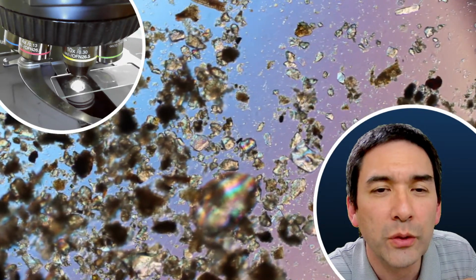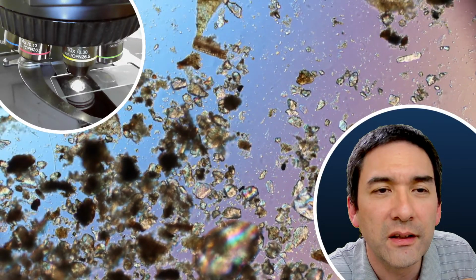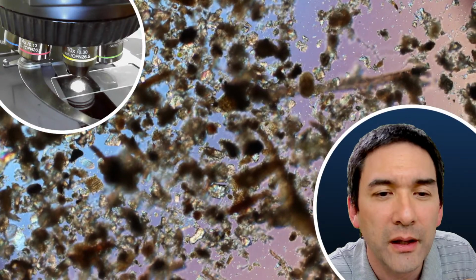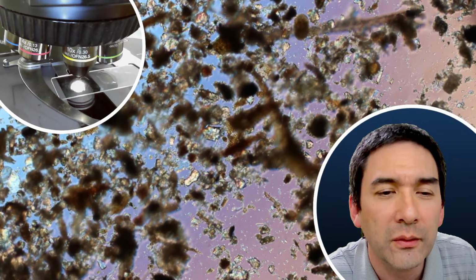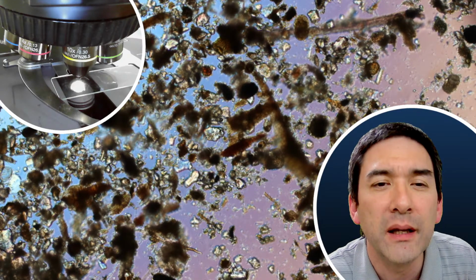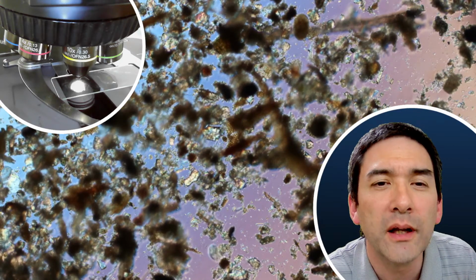So I just would like to say that this is indeed a little bit of a hunt, and it requires patience. They're easier to find than face mites. Could this be one? I don't know.